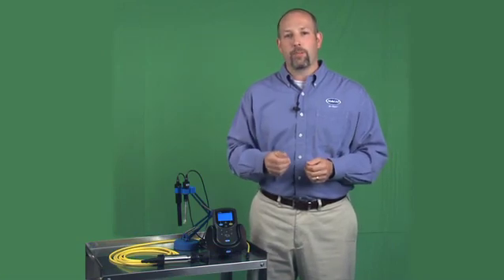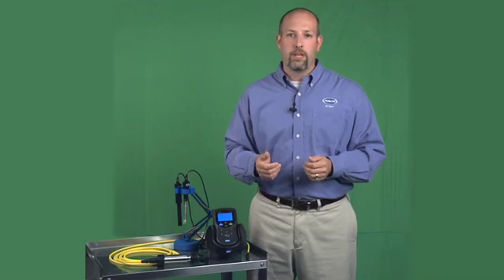Do you use the same meter for measuring pH, conductivity, dissolved oxygen, or other common parameters? Do you need a meter that is used in laboratory and the field?